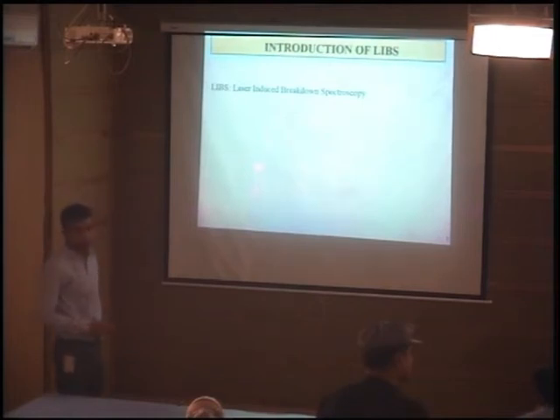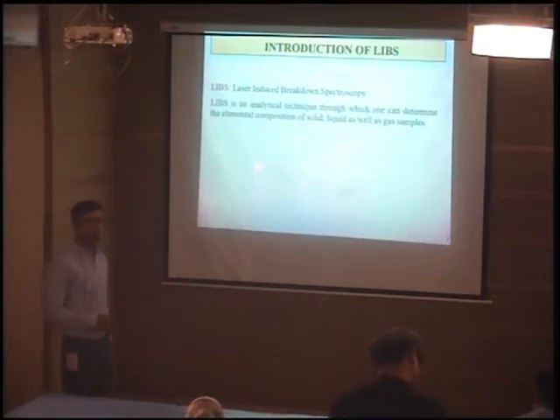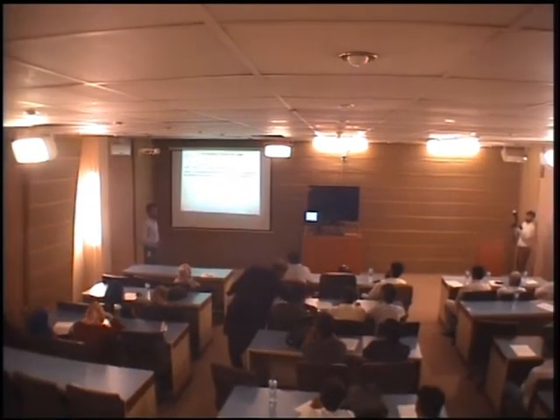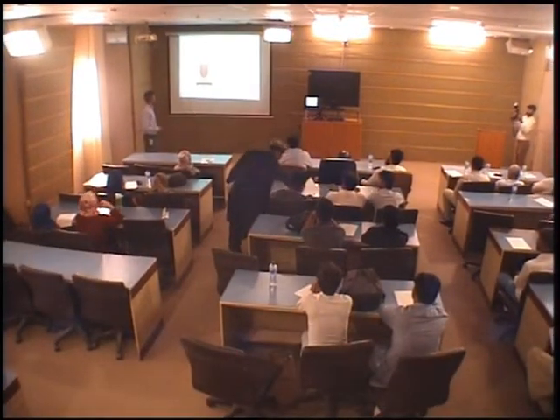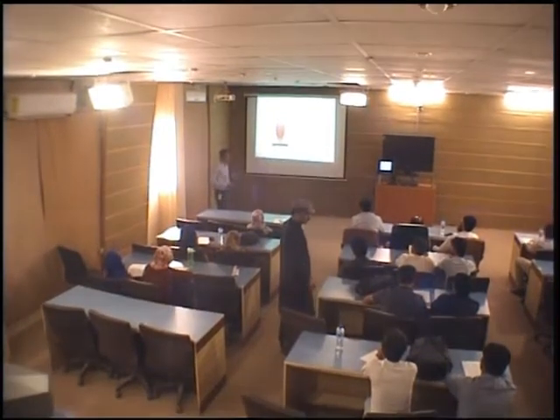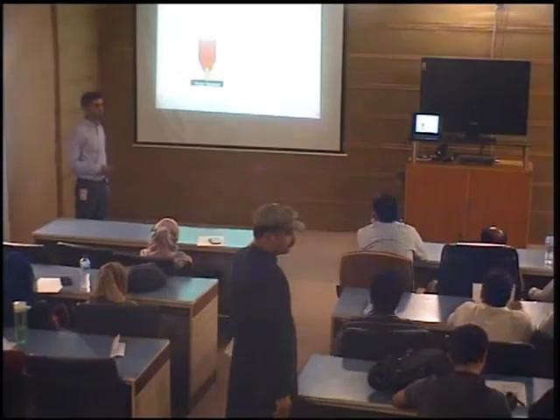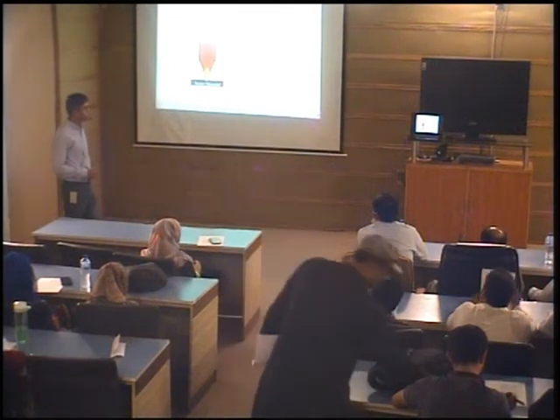Introduction of LIBS. LIBS stands for laser-induced breakdown spectroscopy. It is an analytical technique through which one can determine the elemental composition of solid, liquid, as well as gaseous samples. Overview of LIBS process. The LIBS process basically consists of three separate regions. One is known as plasma generation, second is known as light collection, and third one is known as spectral analysis.